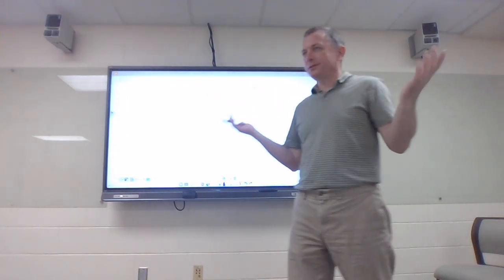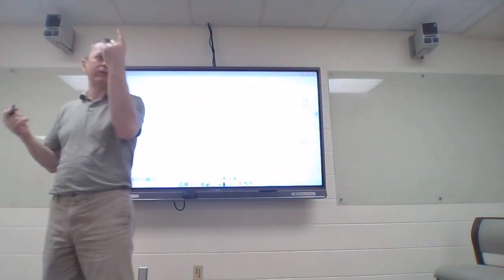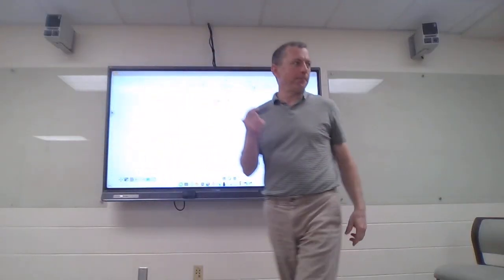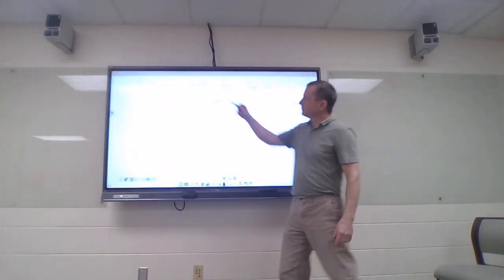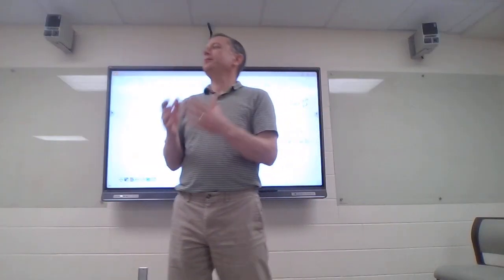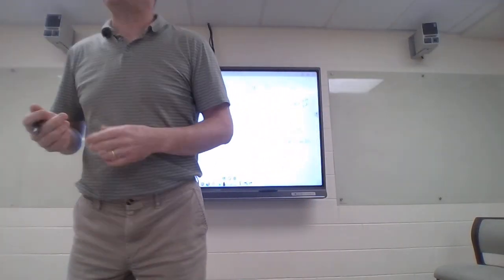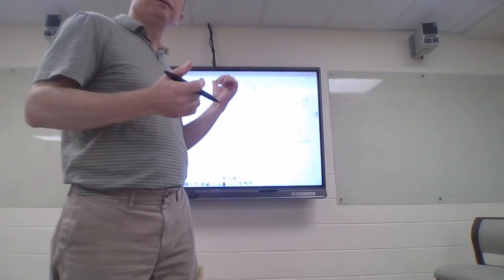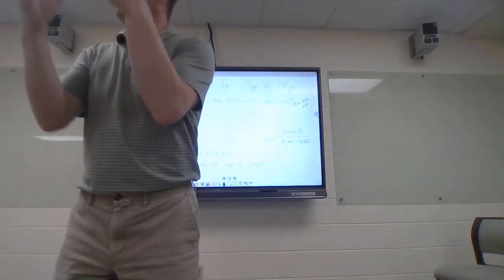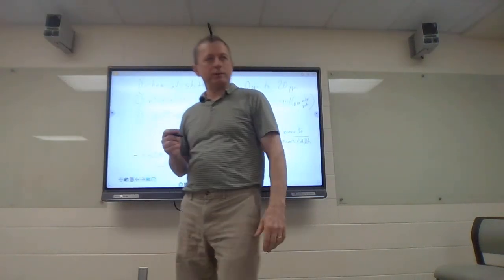Kind of makes sense, right? I've got more signal at that frequency because I have more hydrogens with that same signal. So we can get chemical shift, we can get integration, I can find a peak, look at where it's at on the spectrum, like, ooh, it must be around this many electrons. And, oh, there's at least 3 or 4 or 5 of them all around the same number of electrons, right?